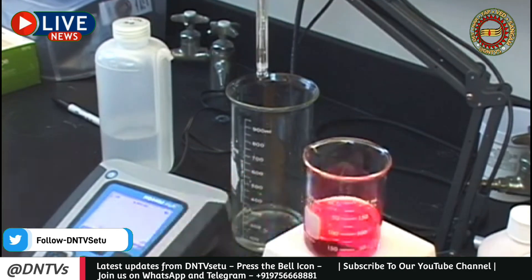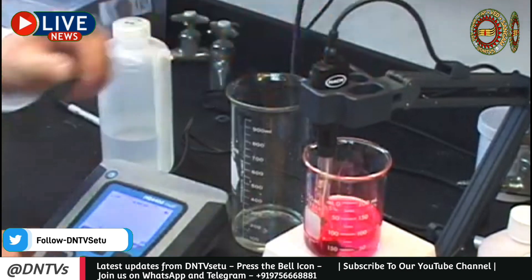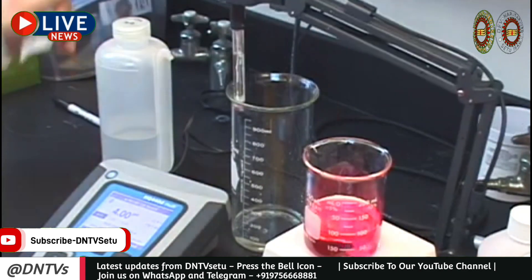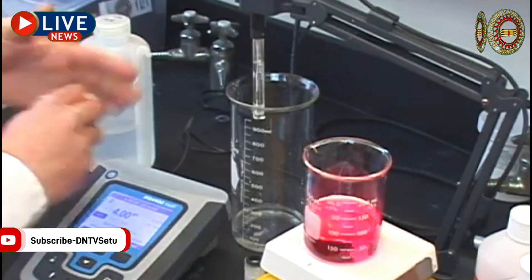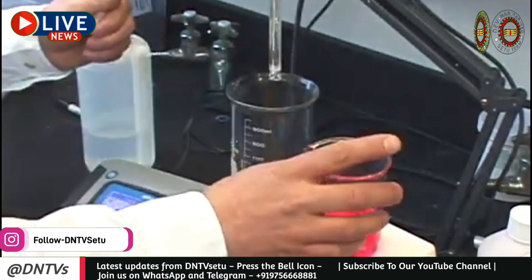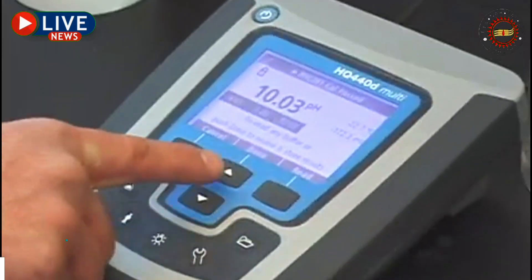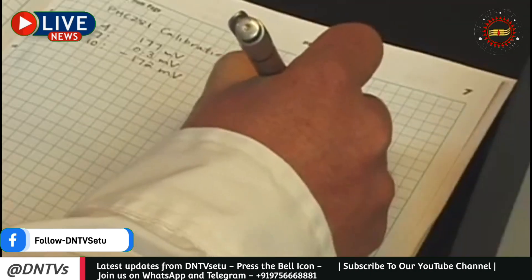Once the electrode is rinsed, follow the prompts on your meter. Immerse the electrode in the buffer solution and press calibrate. Remove the electrode from the buffer solution, clean it with deionized water, and blot any excess liquid from the bulb. Repeat until you have calibrated with all the required pH buffers. Once you have all of your calibration readings, you can record the slope, time, and temperature of the sequence.